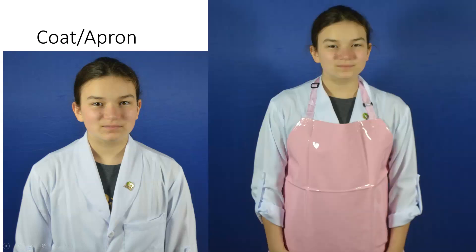The other thing you can have is an apron. In this particular case, it's a vinyl apron, and the vinyl apron is basically water impermeable, so any splashes doesn't soak into the clothing. The lab coat tends to be cloth, which means things can soak into it, whereas the apron gives you an impermeable layer to keep things out.